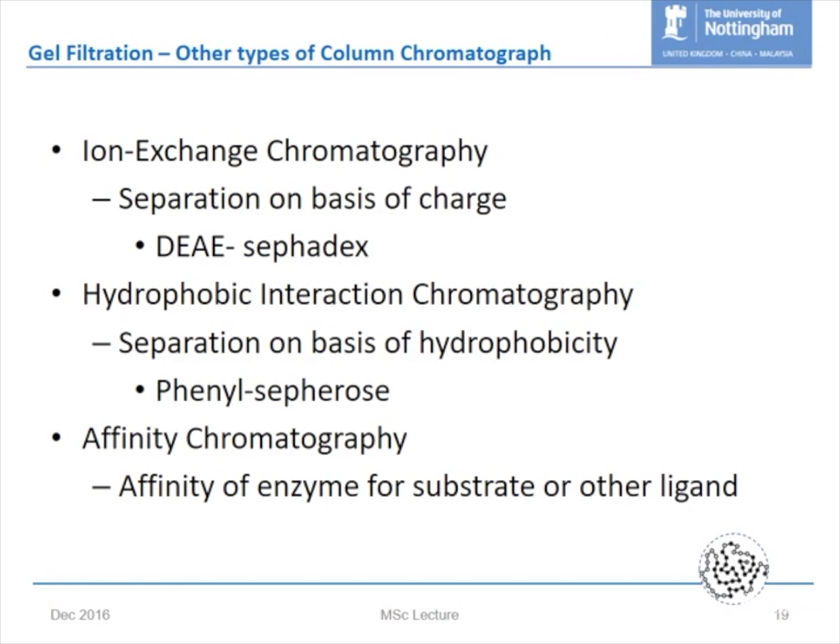All these have a different mechanism by which the analyte interacts with the stationary phase. Everything we've spoken about this morning has been size and shape. Ion exchange chromatography is where we actually have a charge attraction between the analyte and the stationary phase.